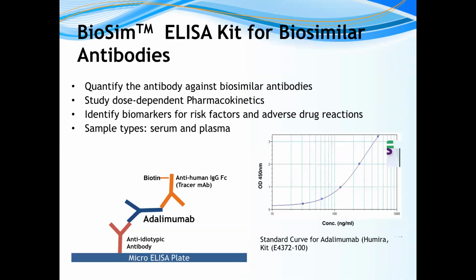As I mentioned, these are very helpful for the life science researchers who are working either on drug development, or the basic researchers, or they are trying to study the effect of these biosimilar antibodies.